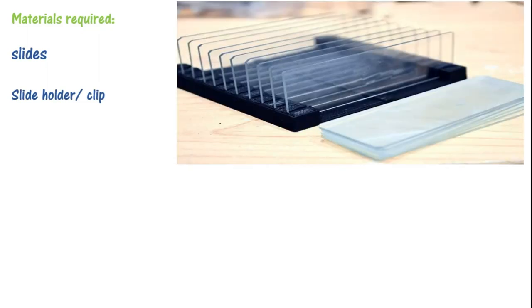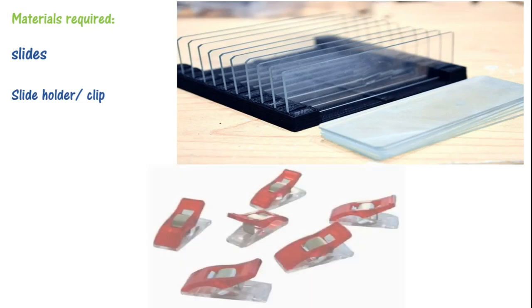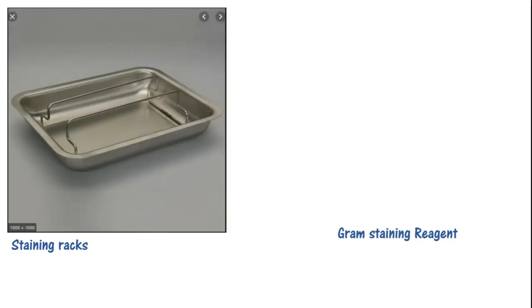Before starting the technique, we will study what we need. First, we need slides, which we will keep the specimen on. The other thing we need is a slide holder — this clip. Now the third thing is the staining rack. When you have stains, reagents, or chemicals, they will not fall down on the slide but rather drain properly.